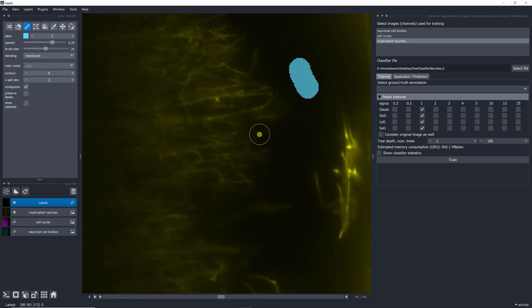It's like giving lots of examples for one situation. When you do machine learning, it's very important to have a very diverse set of training examples. Otherwise you are very prone to overfitting, because you're going to be very good for this particular region, but whenever you look at other regions in your image, and even more in other images, it is going to be harder.